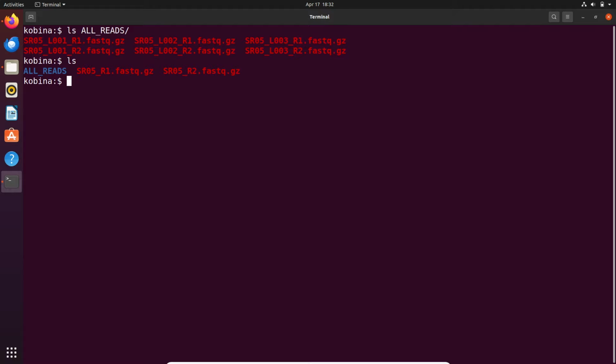So for this tutorial, the only requirement is a Linux system. You don't need any other tool. Okay, so that's what we are going to do. You can also do it in macOS systems, but I prefer we do it in a Linux system.